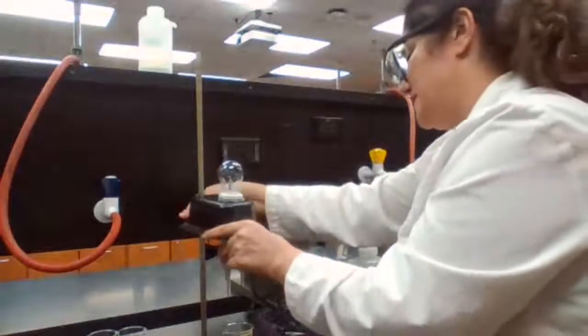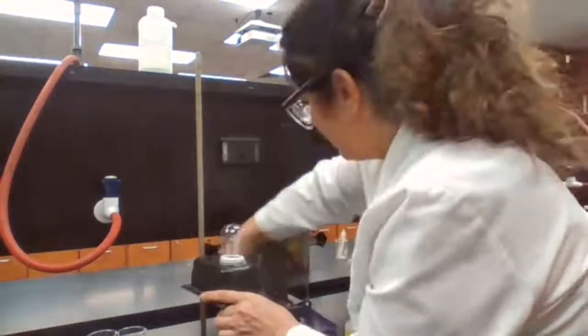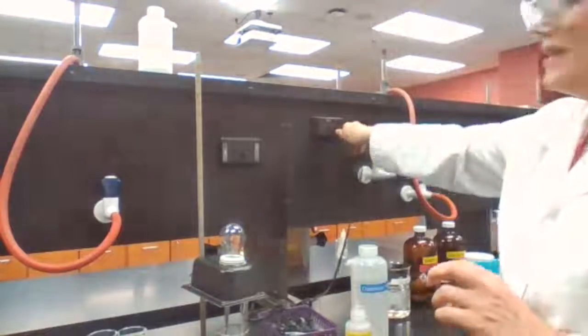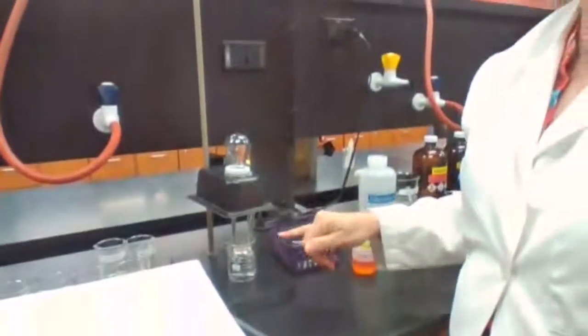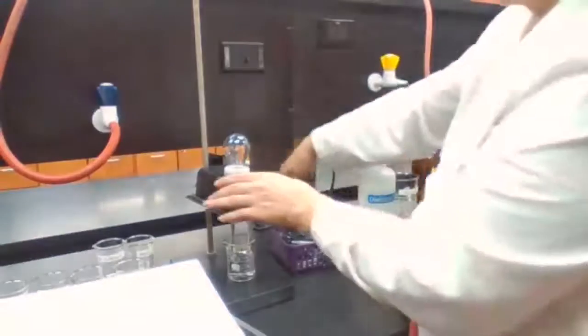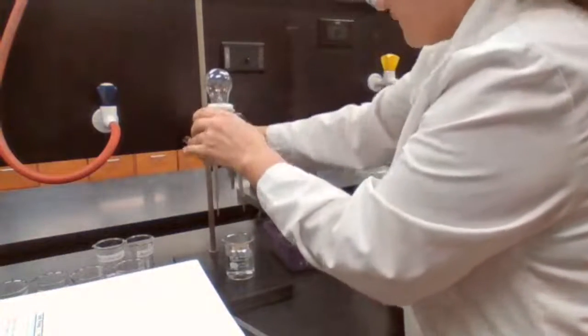I'm going to place the conductometer electrodes inside the liquid and connect. The light bulb did not turn on. Water is a molecular compound, so it is expected not to have any conductivity. So it's not a conductor of electricity.